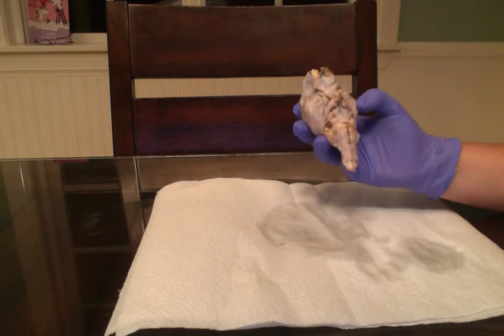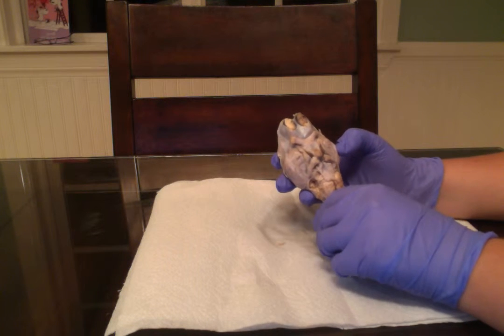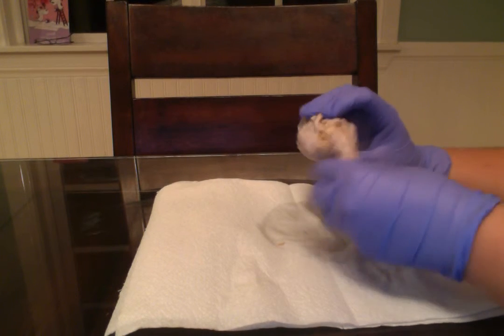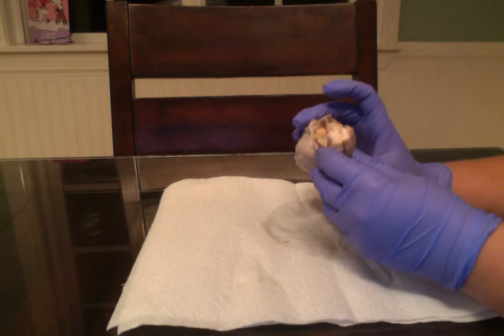So now we're going to look at the midbrain. And to look at the midbrain, we have to separate the cerebrum and the cerebellum. And to do that, we're going to lift up the occipital lobes and push down on the brain stem. So that's how we separate this here. So this has a couple things.